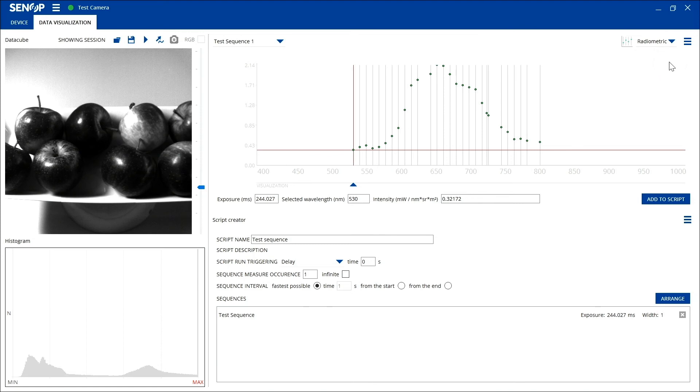The measured data cube taken via the snapshot can also be saved for further analysis by using the Save button.